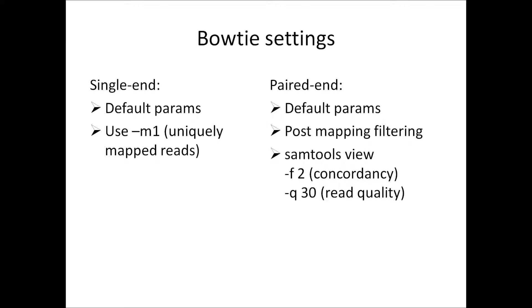Therefore, I run Bowtie2 using default parameters. But then, after mapping, I check the reads to see whether they are concordant — that is, the reads are in a forward and reverse orientation, no more than 500 bases apart. Additionally, instead of worrying whether the reads are uniquely mapped, I look to see whether the reads are of good mapping quality. Both concordancy and mapping quality can be checked using the SAMTools program view. The flags are shown here: "-f 2" and "-q 30". At the end of paired-end mapping, I am reasonably confident that the reads are good quality and concordant.